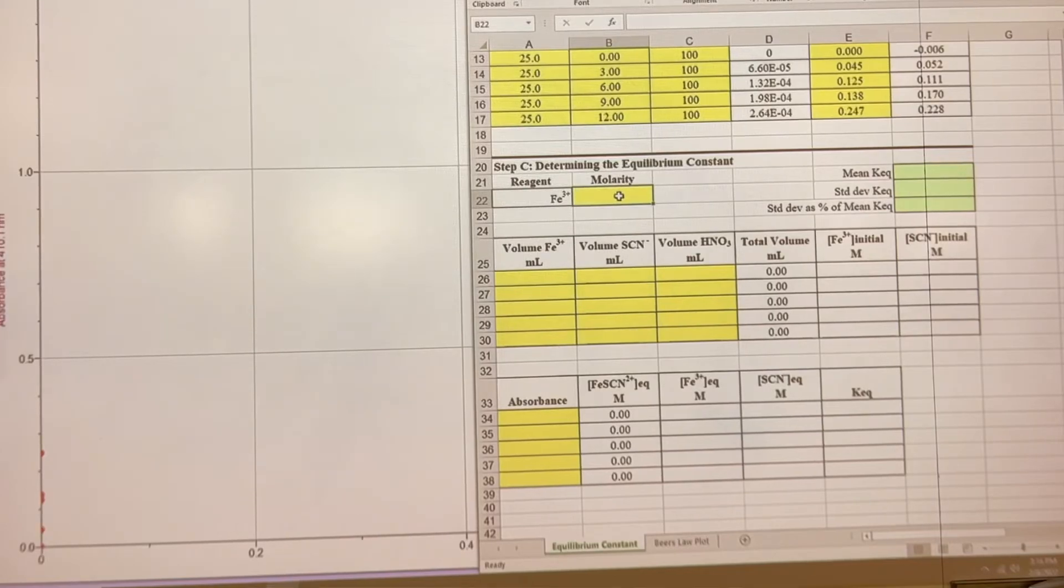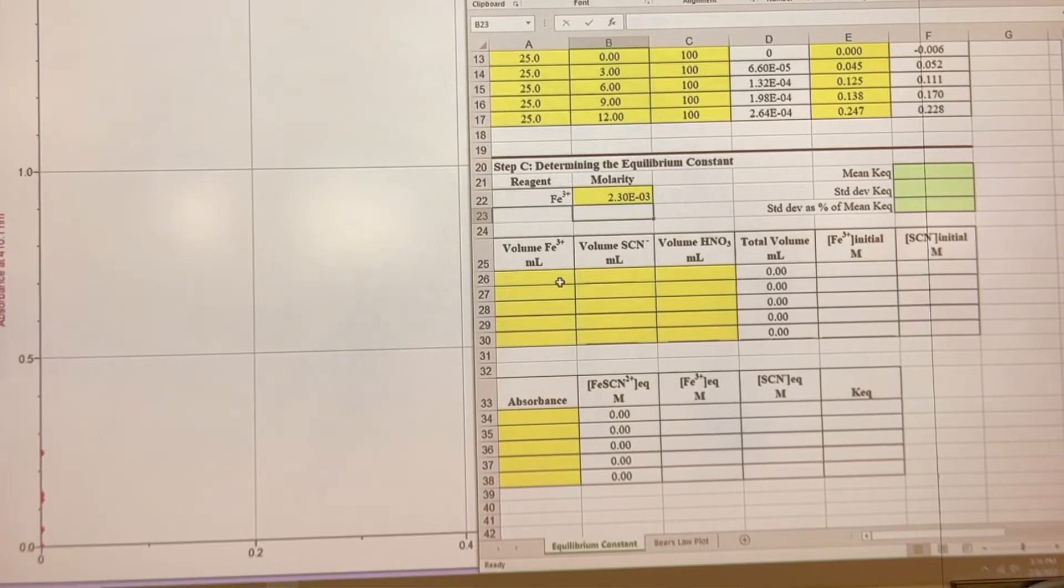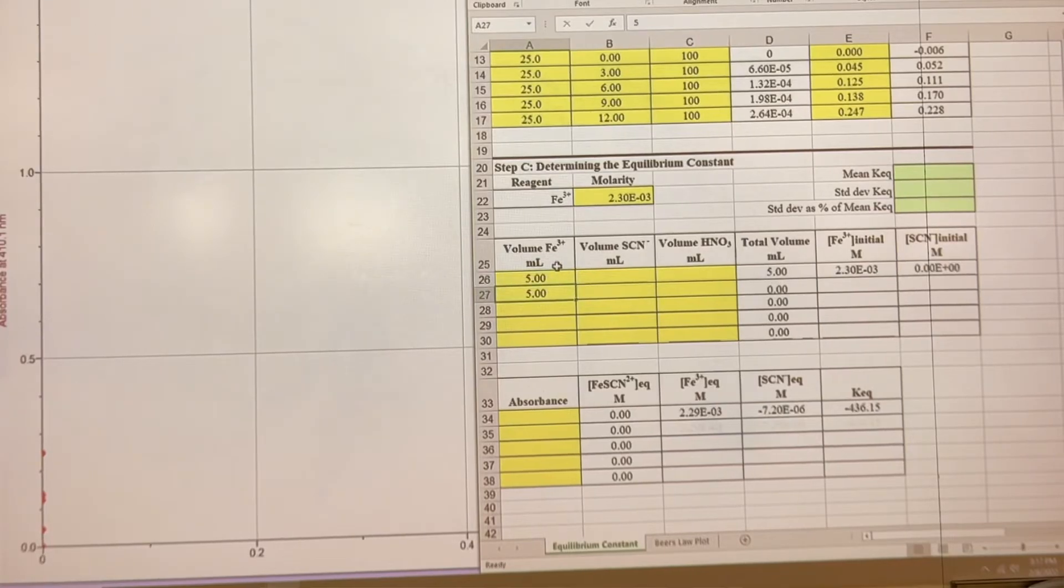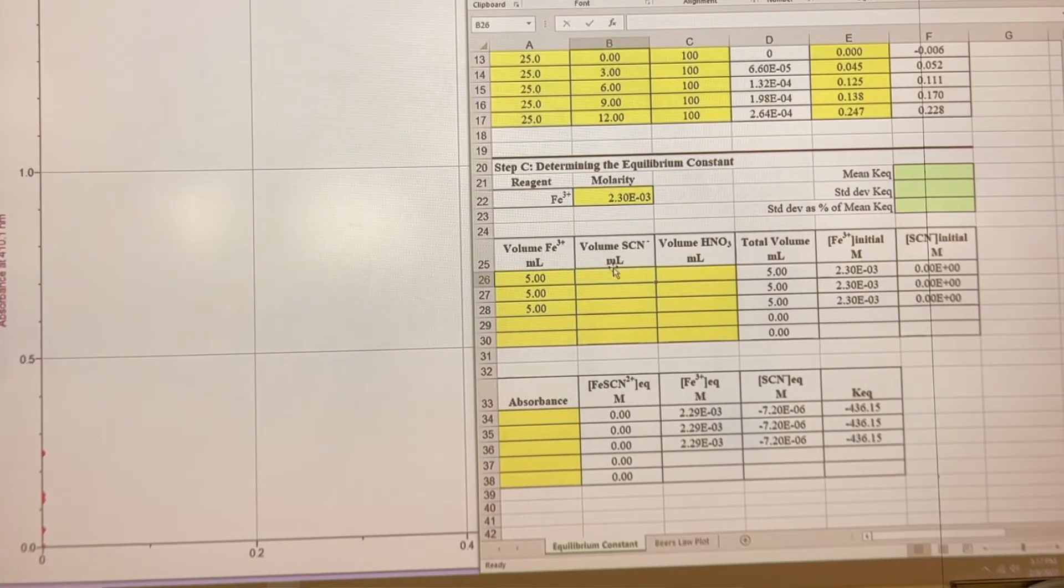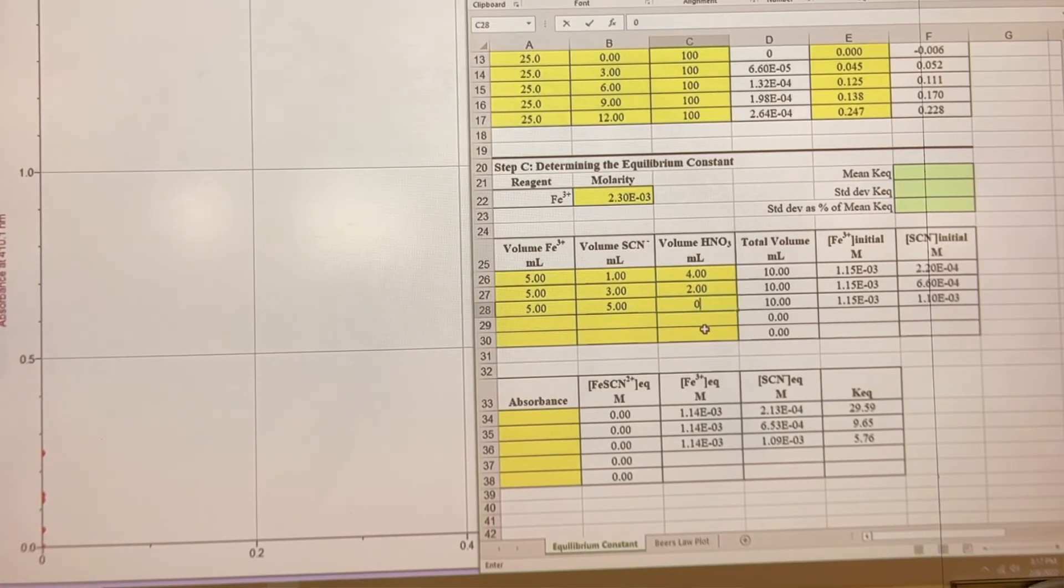Now that we're ready to finish part C, we input the text box for the molarity of the more diluted ferric nitrate concentration. That was 0.0023. And then, as you recall, whenever we made these test tubes, they did have different amounts of reagents that were added to them. The iron, for each one, we added five. The sodium thiocyanate we added them in increments of two, starting at one. So, then, the first one got one, three, five, and then we went backwards. The one that had the least amount of sodium thiocyanate got the most amount of nitric acid. So, that was four, two, and zero. And for a total volume of 10 for all of them.